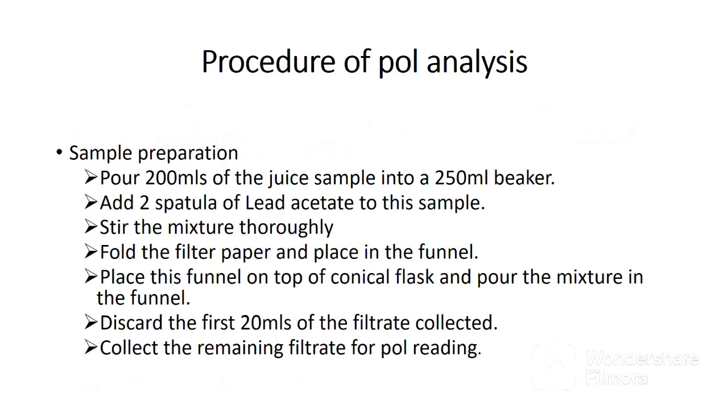Procedure of pol analysis is the same for all juices. So you can decide to analyze one sample. For example, you can start with first expressed juice. After that, you go to the next, which is mixed juice. You do like that up to the end. But if you have experience in this analysis and you are sure that you will not interchange the results of these juices, you can run the analysis of all juices at once. This procedure is divided into two, that is sample preparation and pol reading.